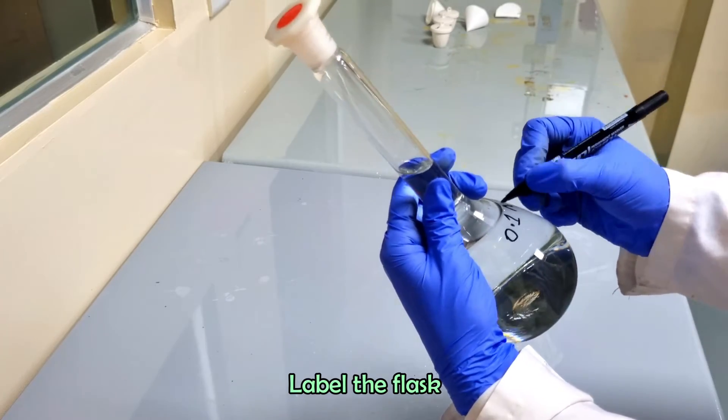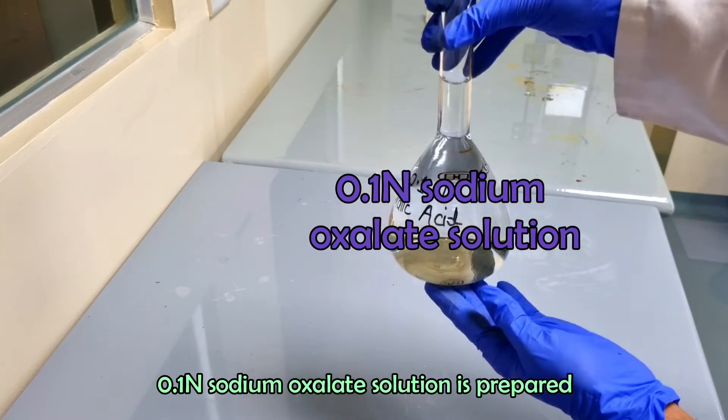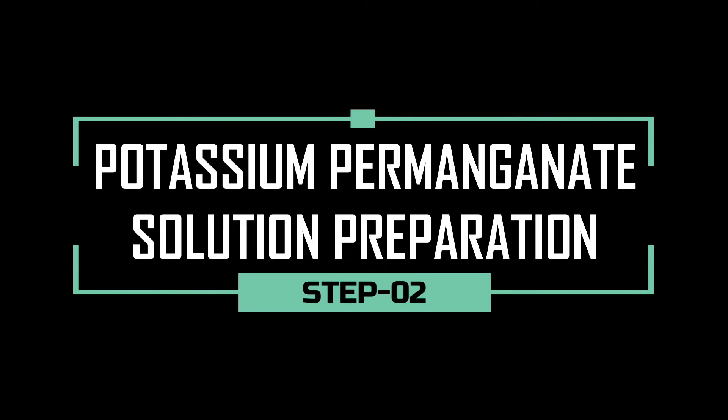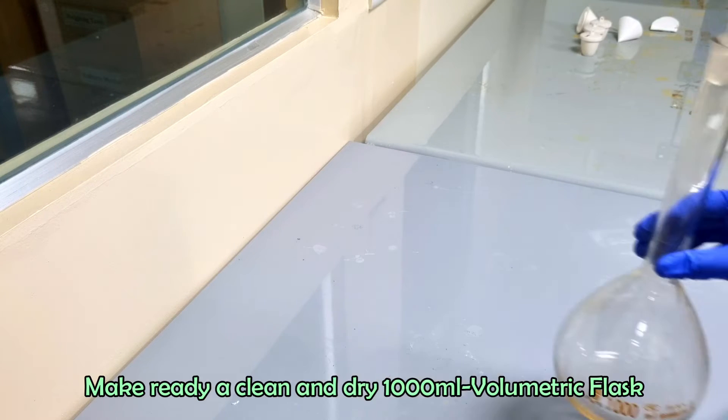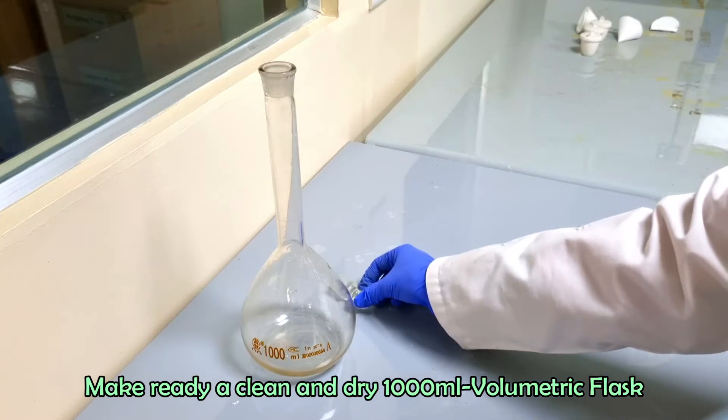Label the flask. The 0.1 normal sodium oxalate solution is ready. Now we are going to prepare 0.1 normal potassium permanganate solution.